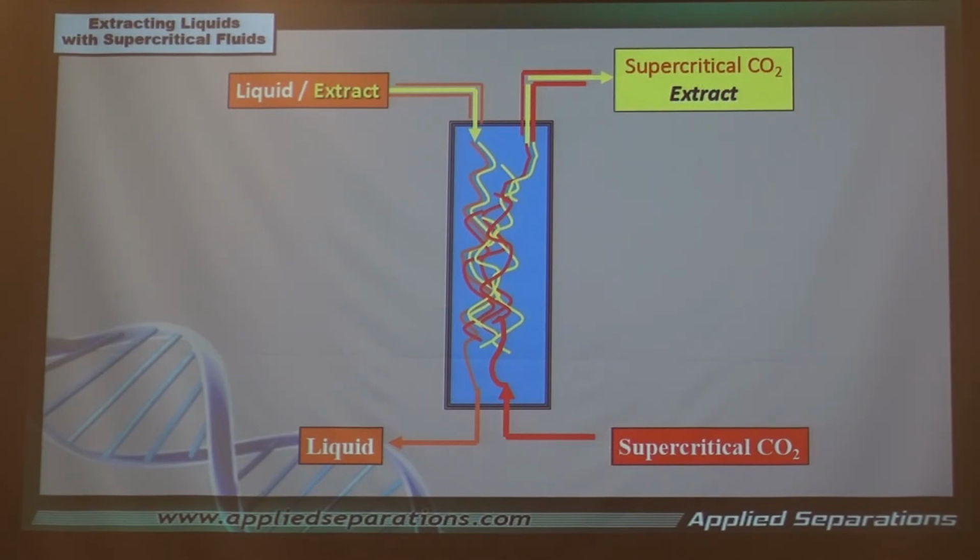You can make these calculations, but essentially what we're doing here, conceptually think of it in this qualitative way. What we have is a denser liquid falling through a less dense medium. That's all we're doing. We're controlling the density. The liquid, we're not controlling that density. That could be anywhere from one, wherever that density is.